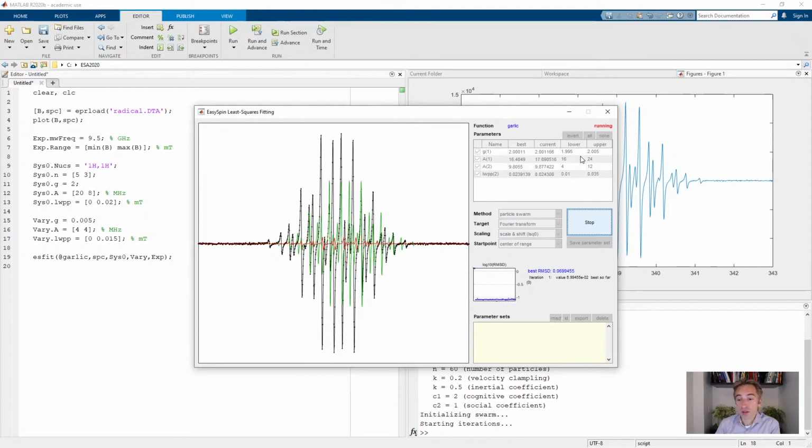In general, if you want to achieve a good fit, you have to have three important things. First, you have to have good signal to noise in your data. Second, you have to have a good starting point. The closer your starting point is to the actual fit parameters, the more easily you will find it. For example, if you're looking for the Dead Sea minimum in Israel/Jordan, it's better to be in the Middle East than to be in South America.